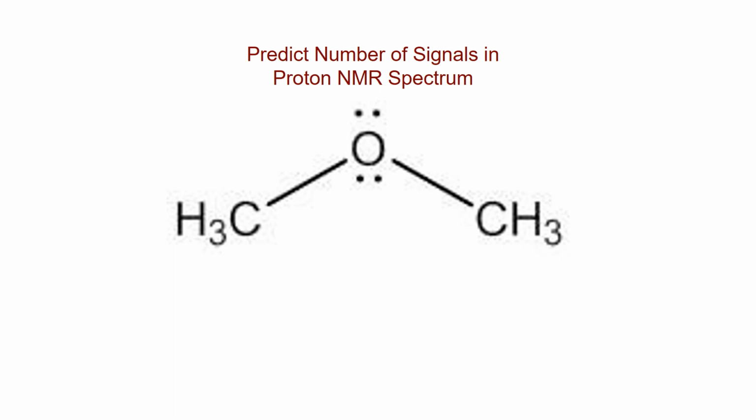This goes back to looking for symmetry like we did when we studied stereochemistry. And if you take a look, you see that this is a symmetrical molecule, and so there's no reason that the three protons on this side would be spending their time in any different type of environment than the three protons on this side. All of the bonds are going to be exactly the same, the orientation in space and everything. So we would only predict one signal from this compound.